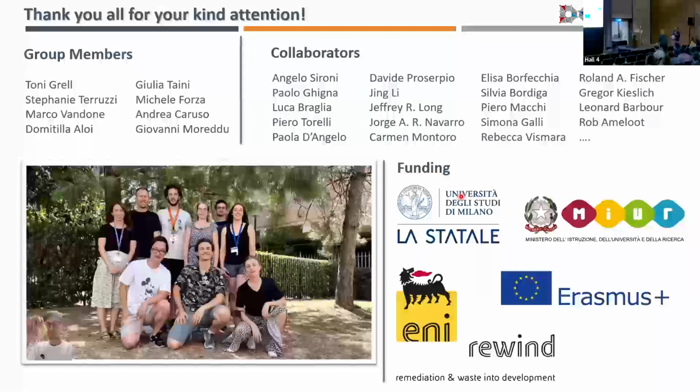Vitaly Sushkevich, Paul Scherrer Institute, Switzerland. Thank you for the lecture. I wonder whether you tried X-ray emission spectroscopy or valence-to-core spectroscopy to access the spin states of your iron BDC MOF. So on the iron 2+ system, no. We have performed this experiment on MIL-100 iron for other reasons. And maybe next beam time, we are in the process of deciding.